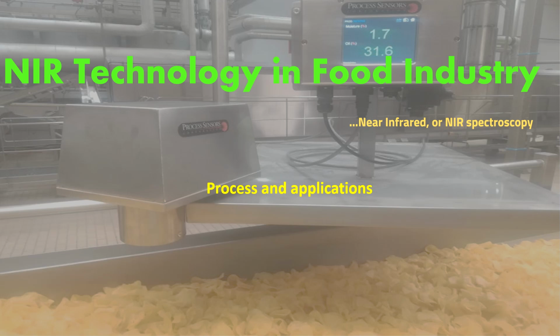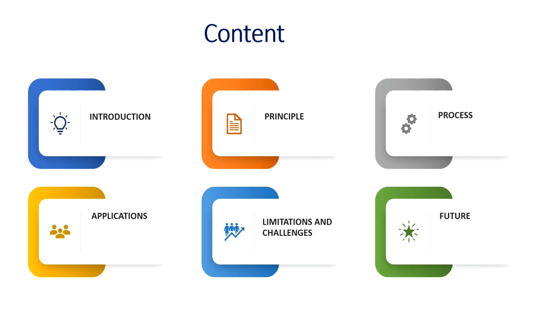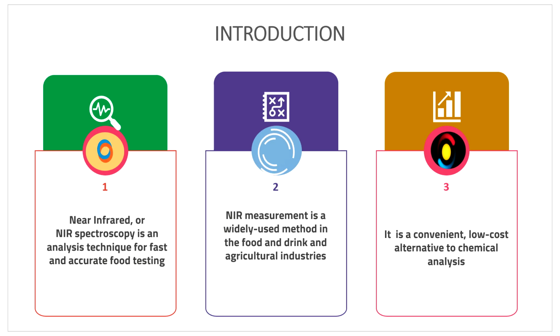NIR technology in food industry, process and applications. The contents of this presentation include an introduction, the principle, process of NIR, applications, limitations and challenges, and finally the future prospects. Introduction. Near infrared or NIR spectroscopy is an analysis technique for fast and accurate food testing.